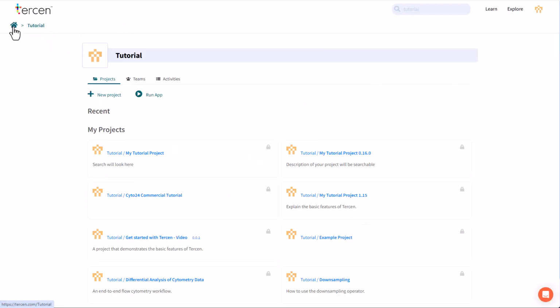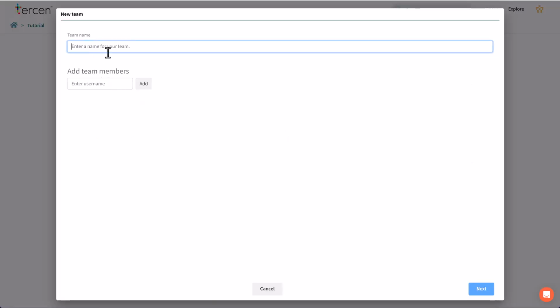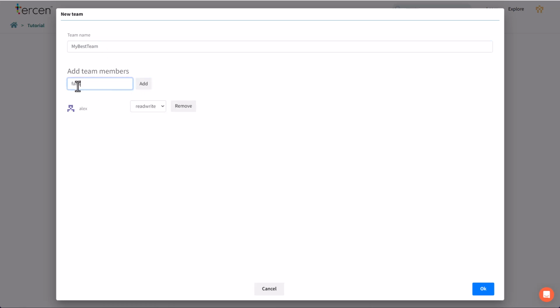We will conclude this tutorial with a look at teams and link sharing. Anybody can create a team and add new members. People can be added by their username or their email account. Any projects created while inside the team will be visible to everybody in the team.